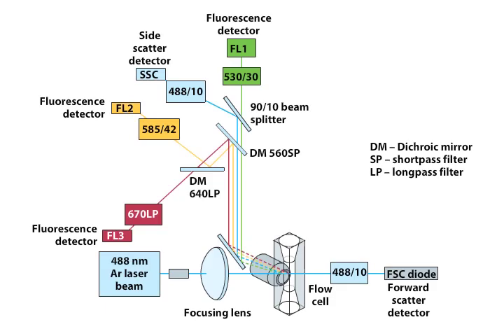Flow cytometry is an analytical technique that quantifies the frequencies of cells binding to fluorescent antibodies and scattering light in characteristic ways. Flow cytometers use laser beams to provide fluorescence excitation and a series of detectors to identify both scattered light and fluorescent signals from single cells flowing in a focused stream past the laser.